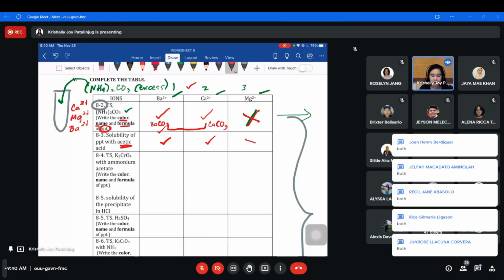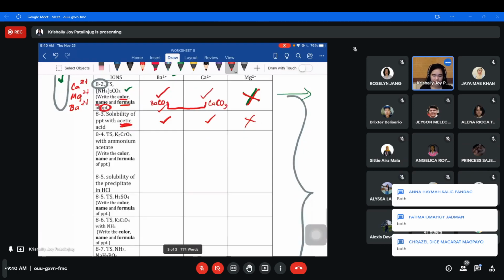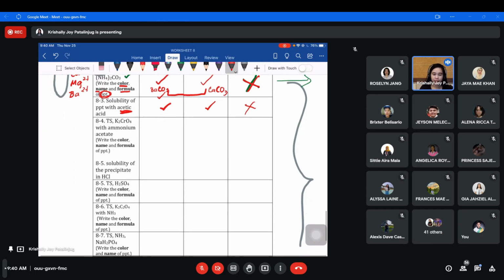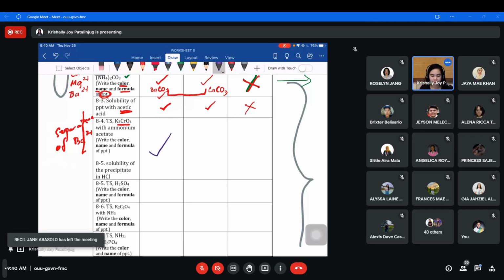Okay, ito, wala pa din. No, wala siya dyan. Walang sagot dyan. Okay? And then, after dissolving with acetic acid, we confirm, no? Not confirm, but we separated, no? Separation siya. Separation of barium ion from calcium via addition of potassium chromate. Kasi 'di ba, the chromate of barium is least soluble. So dapat yung may sagot lang dito sa column is ito. Nakuha itong portion na to.